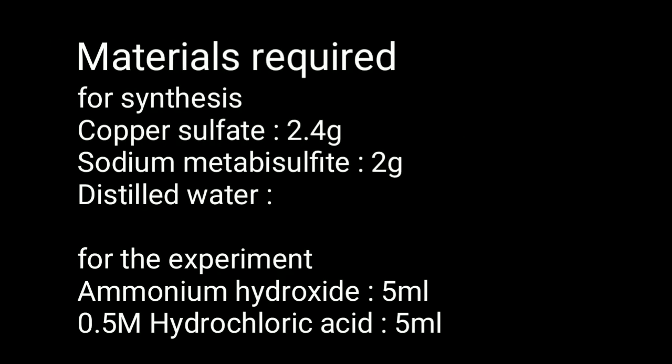For preparing this salt we need 2.4 grams of copper 2 sulfate pentahydrate and 2 grams of sodium metabisulfite.